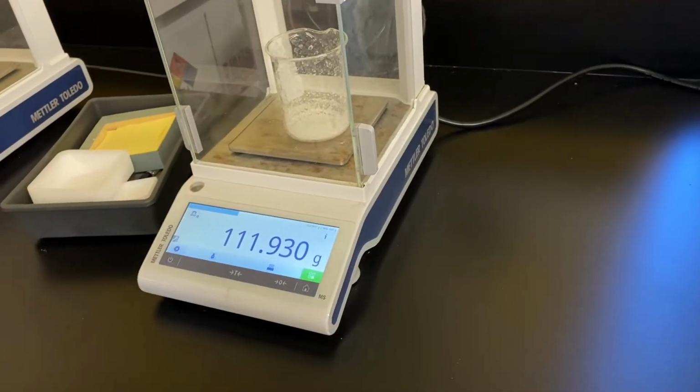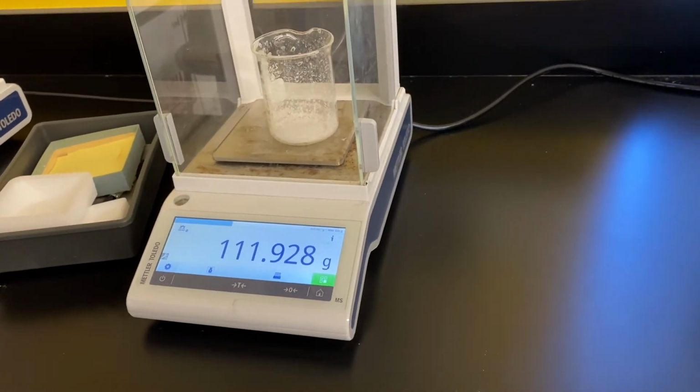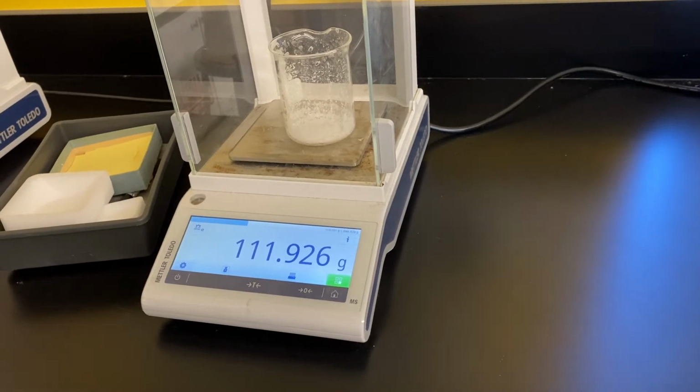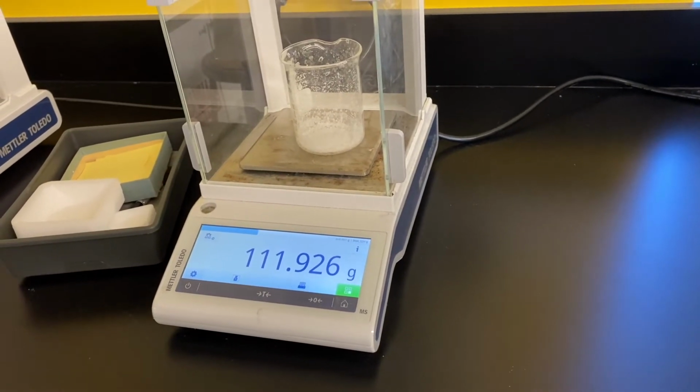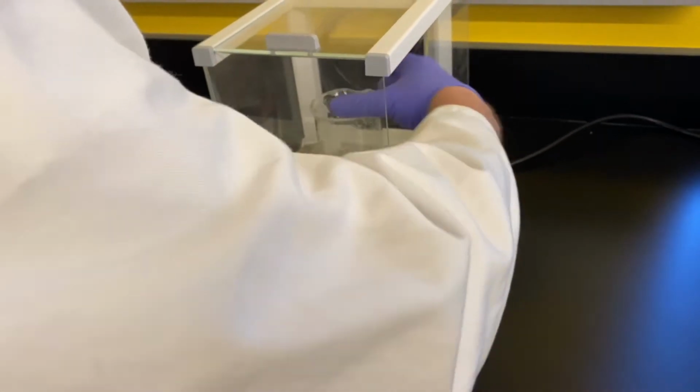All right, so we're going to take the mass of it twice. We'll take it for the first time. The way you'll figure out how much is in there is you'll do the difference, right? Whatever the beaker weighed by itself, and the difference between this new mass. But then we're actually going to put it back in the oven just to make sure that it's completely dry. And you'll see. We'll take it, we'll put it back in the oven, we'll weigh it again.